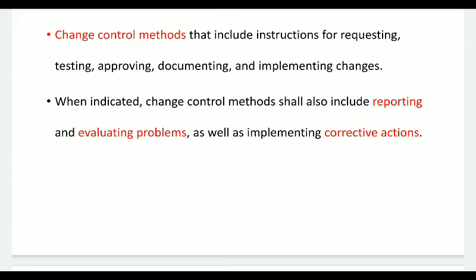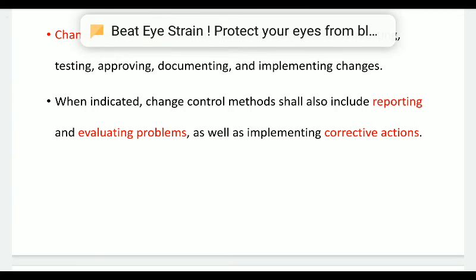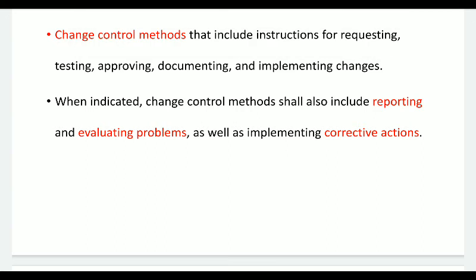Now during the development of this change control method, there is a possibility that the operator may face some issues, operating issues, or you can say technical issues. So whatever problem that person is facing, it should be documented properly. Also, what are the solutions or how he is dealing with this kind of problems should also be documented properly for the future references.